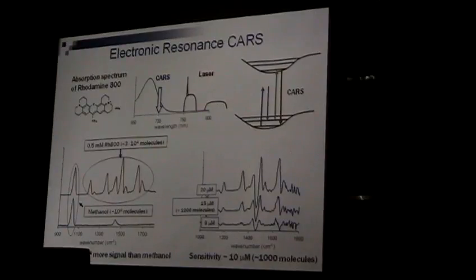And what we were very interested in is, this is not fully resonant yet. We found that in the early 1990s, non-microscopy people already demonstrated you can get micromolar-level detection with this enhancement in bulk measurement. So the real problem is how to tune your laser spectrum up to here. That's why we are working with Continuum.